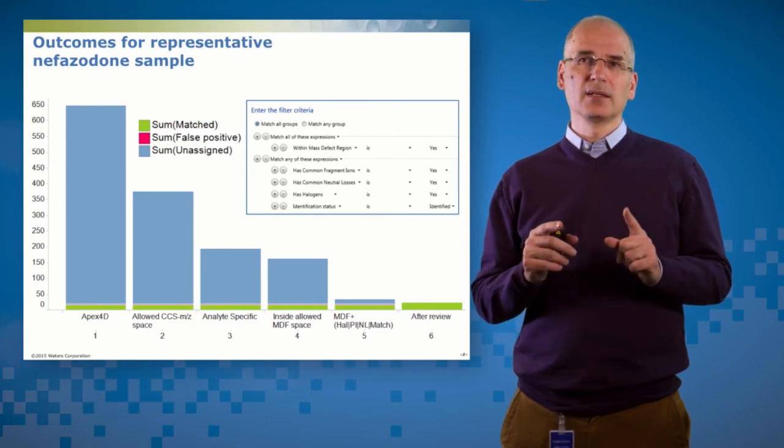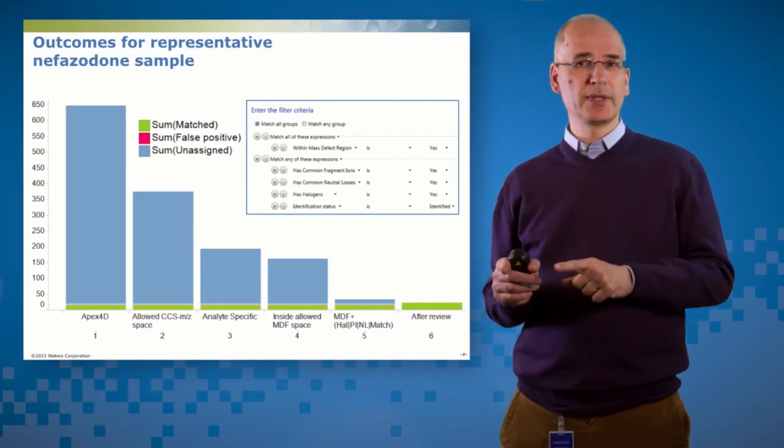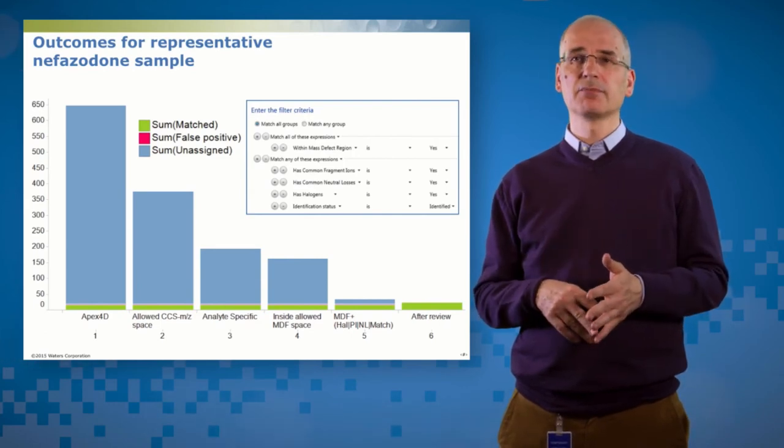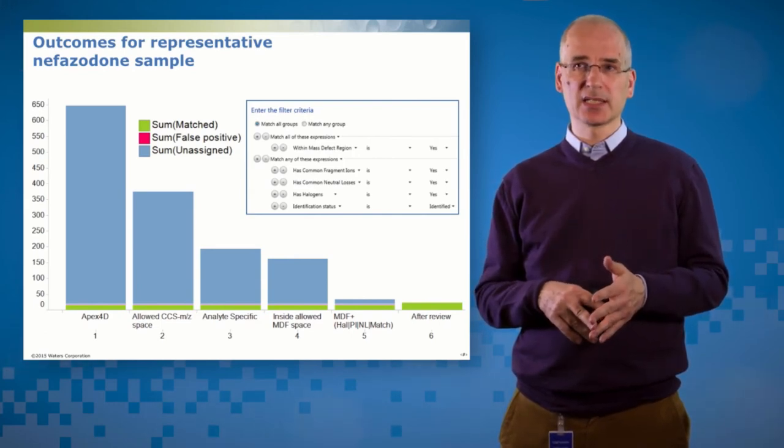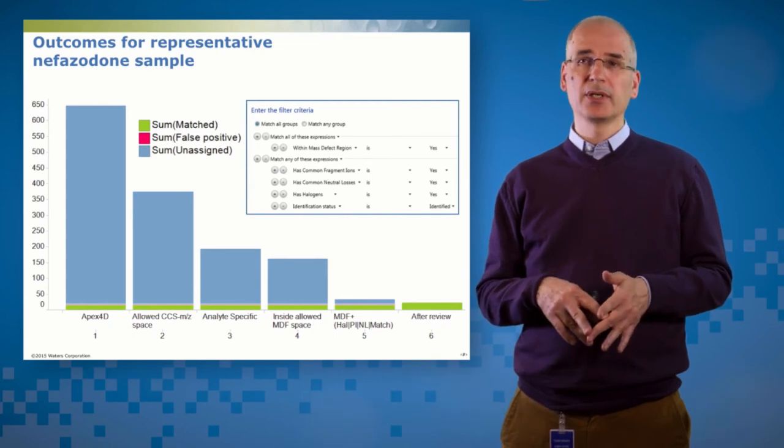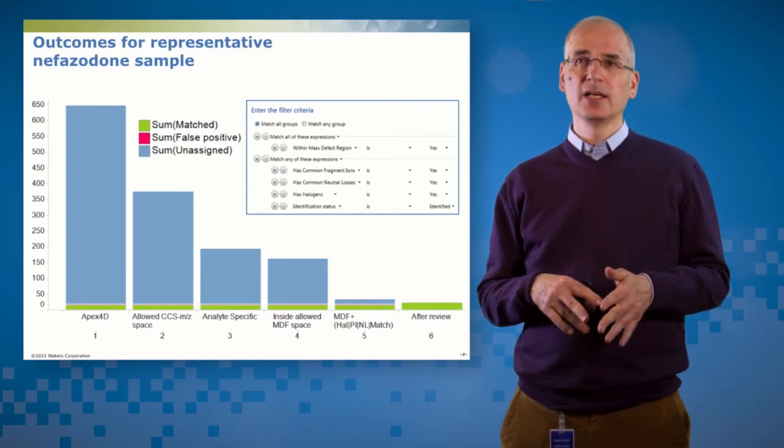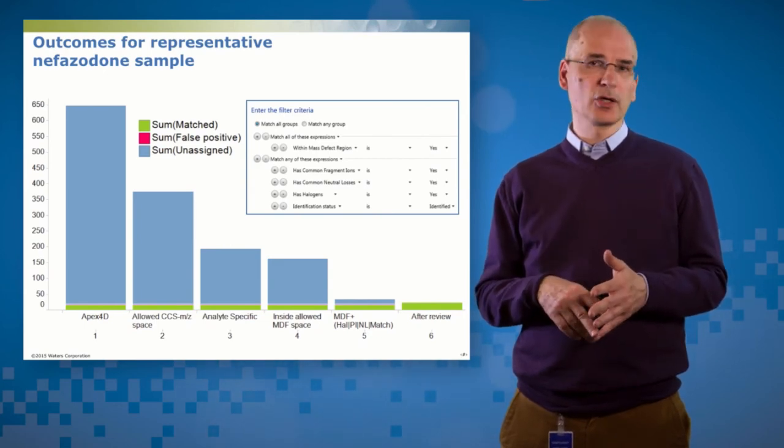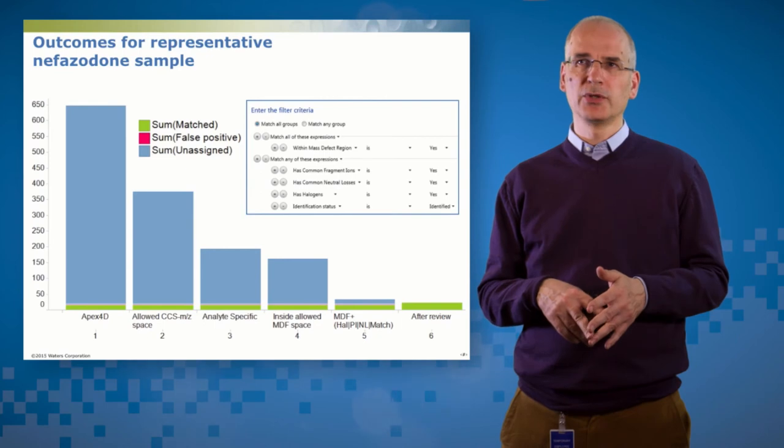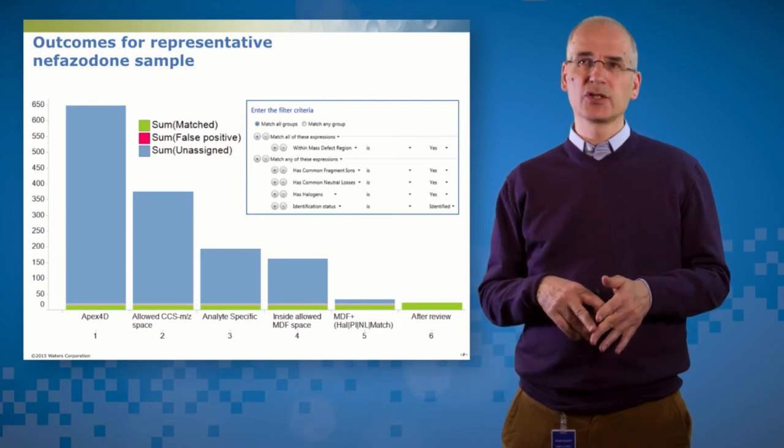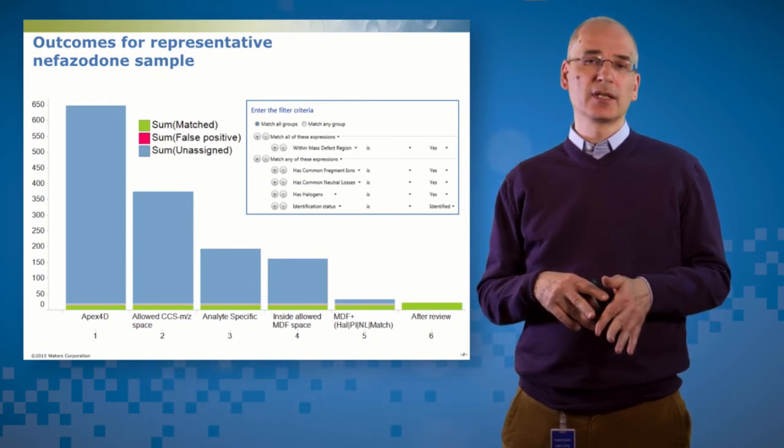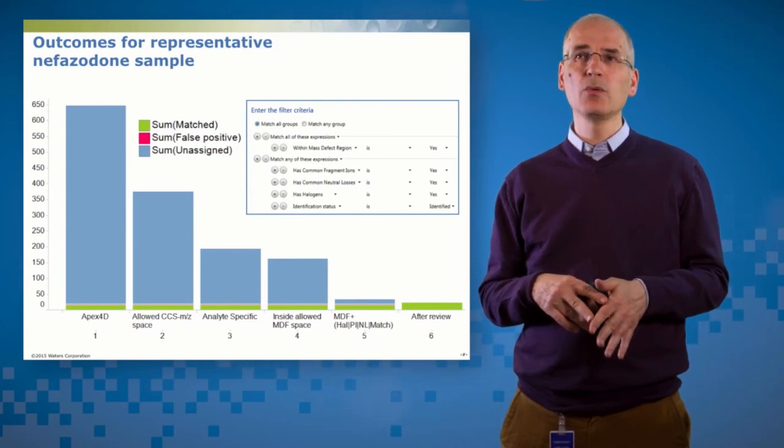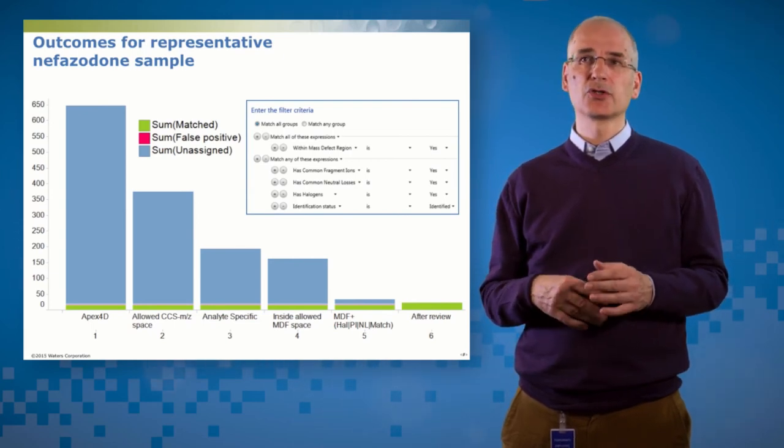I can then say, if it's in that space, but it's also in the control, remove it. So now I want analyte-specific components which are in allowed mass CCS space. And then I can impose a mass defect filter. And then finally, I can say, show me those, but then highlight the ones that have got either a common fragment ion or a common neutral loss, or they have a halogen isotope pattern, or they've been assigned a plausible biotransformation by the software. So if any one of those four properties are true, keep it.